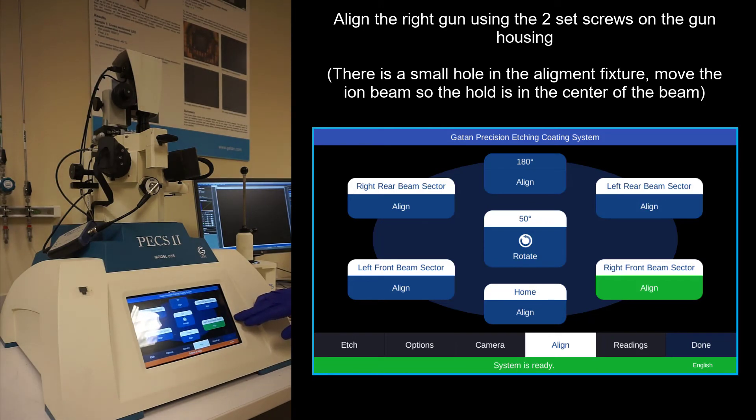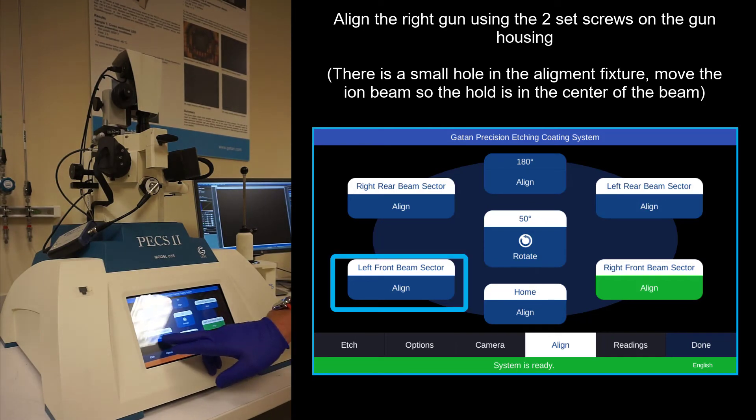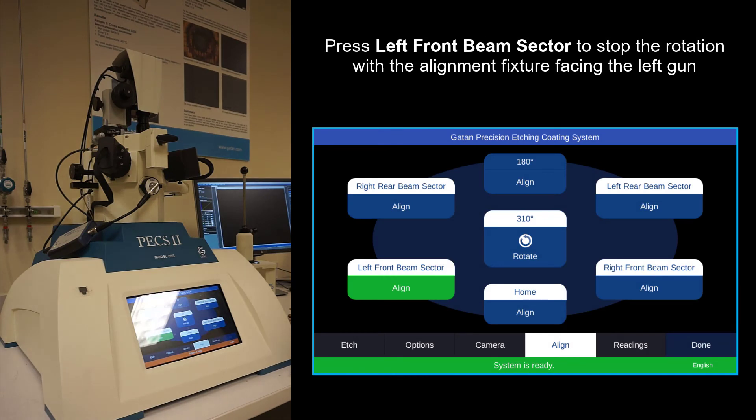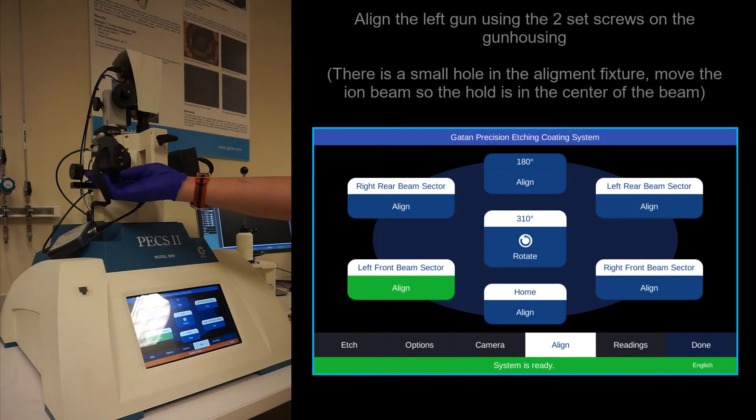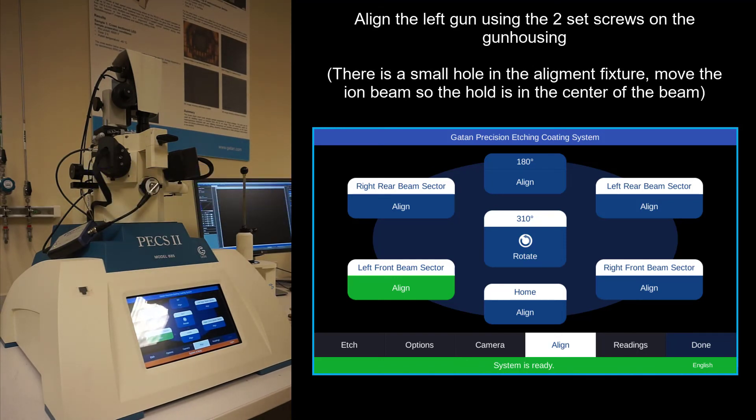And then once you have the right gun aligned, then you will go to the left gun. And then same thing here, you have the two set screws, one horizontal, one vertical. And then align the gun.